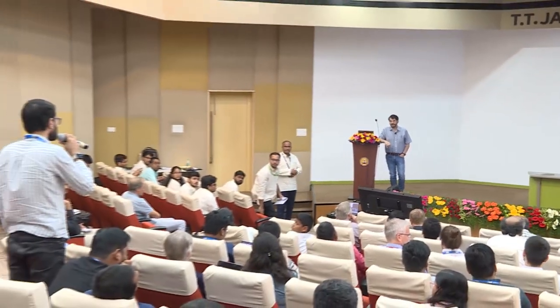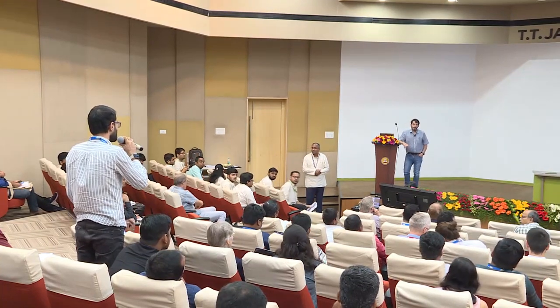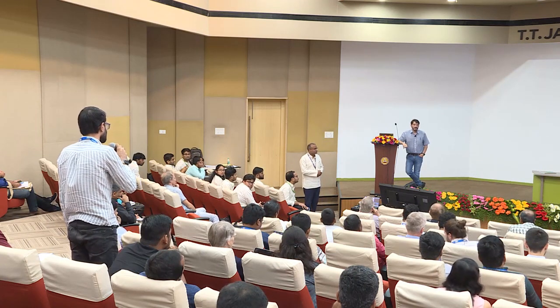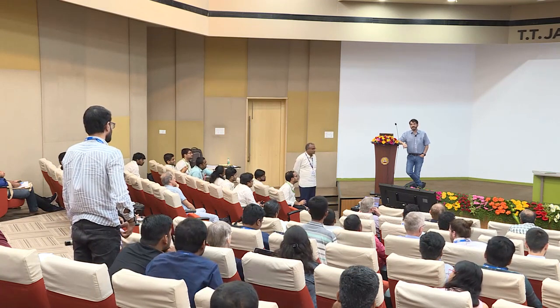Hello, Professor. Thank you for a wonderful talk. So I have a question, what is the typical material of the droplet emulsions that is being used? And the second question is, what is the typical life these droplets are being stable for without any variation in the size? So, those are good questions. We use many different types of materials.